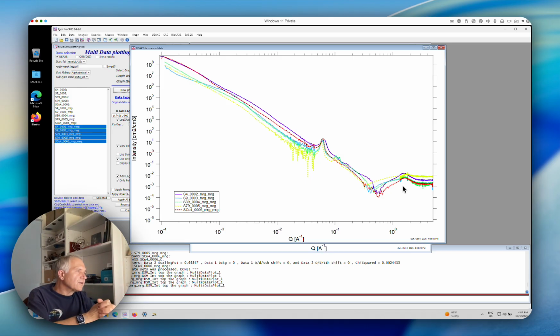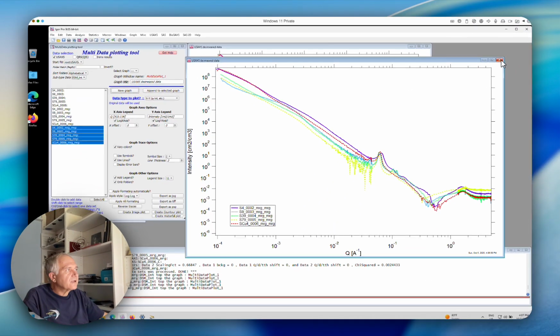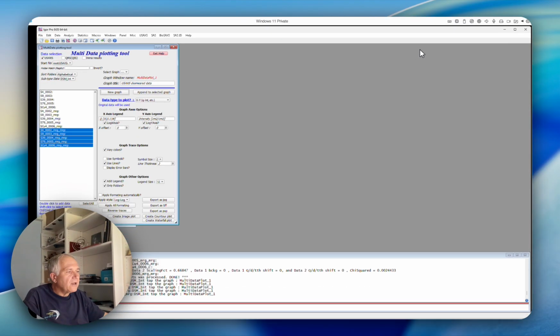All of that can be collected on the instrument within probably about 2 minutes. And the data reduction I just walked you through can be done within a minute or 2 per sample too. So this is a detailed data reduction. Things will get easier in the future. But if there are any failures or any unusual events, this method will be used anytime into the future.